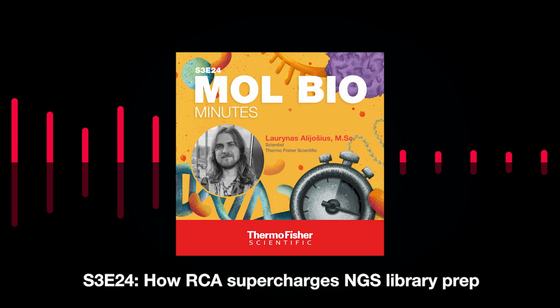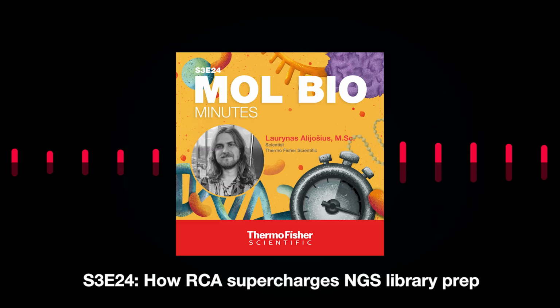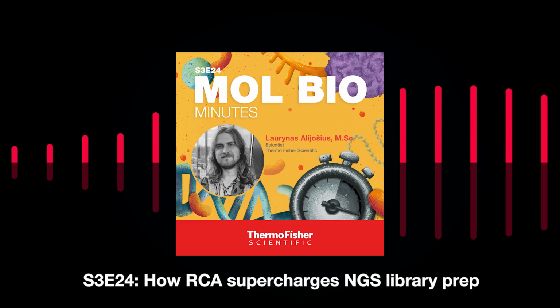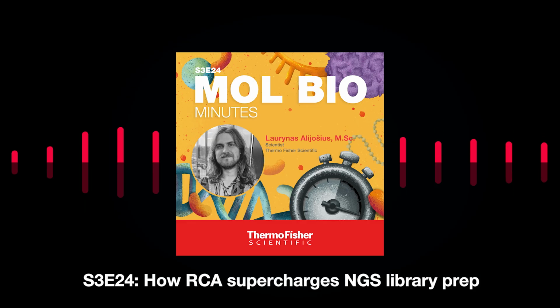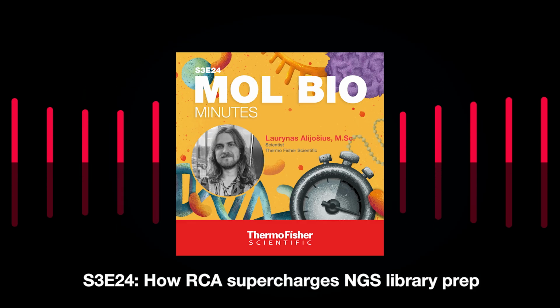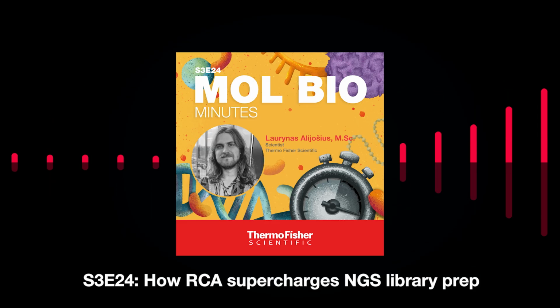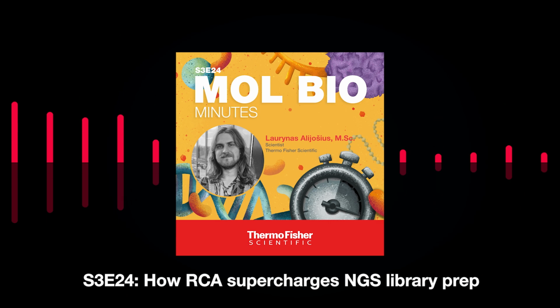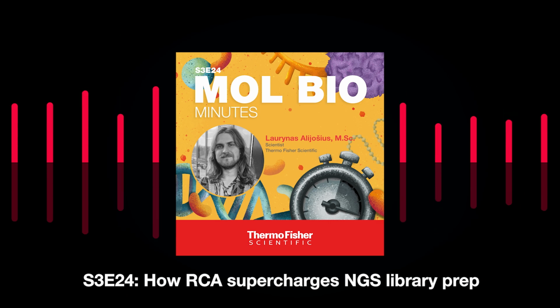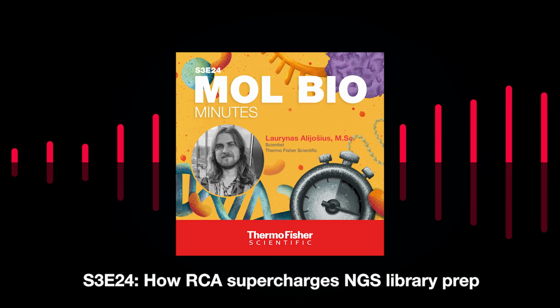Even more, it can be used for many things. For example, RCA can also be applied for DNA nanoball sequencing. It can be used for in vitro transcription or cell-free protein expression or to detect single nucleotide polymorphisms. And if you talk about whole genome amplification, it can also be applied for real-time target detection. So if you're curious to learn more about these other applications, please check out the resources linked in this episode for more information. So that's about it for the role of RCA in NGS.